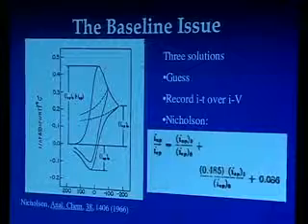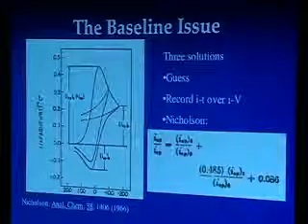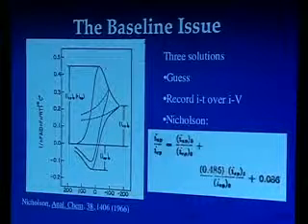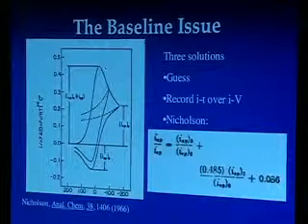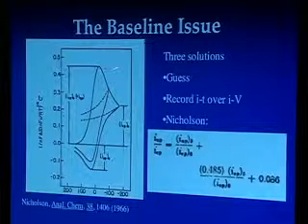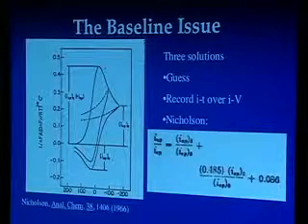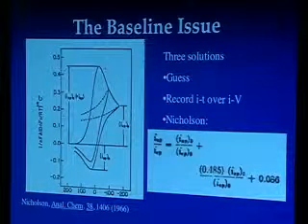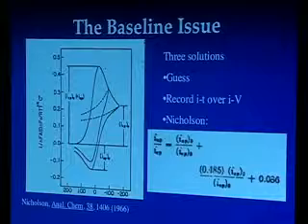You can get into a lot of problems with all the techniques, but in particular the guessing technique. It would be wonderful if every cyclic voltammogram looked like this one right here, which is some theoretical construction. But often you have a secondary electrochemical process that occurs somewhere out here, not too much beyond the peak. And so you can't see this nice limiting current over here, and you run into trouble when that happens.